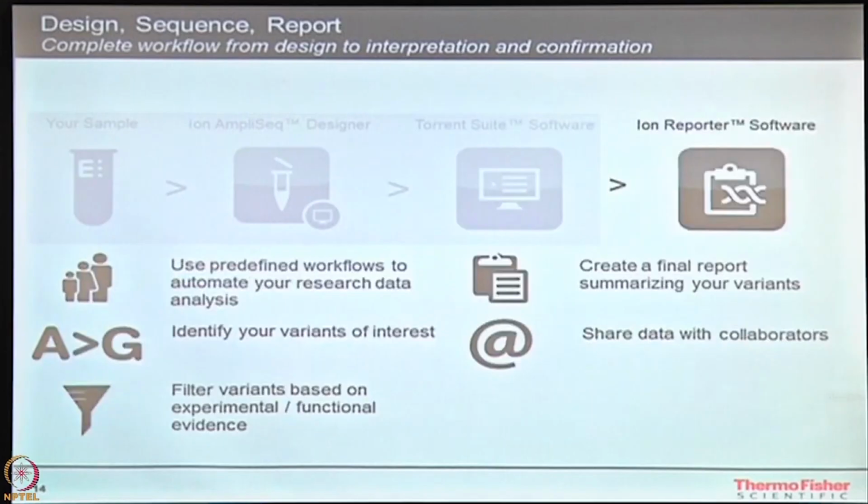So, you need to know something more about that. For doing that, there is one more tool called Ion Reporter software. It has lots of information inbuilt into it. So, this helps you to correlate your variant with the information that is already stored in databases. Okay. Ion Reporter software is available as cloud based. So, you can register yourself, sign in and utilize it for your analysis. Okay. During variant calling, we have a format called VCF, which is generated over here. Whatever variants that you call, these would be provided in a VCF format, and these VCF files could be easily uploaded on Ion Reporter software.